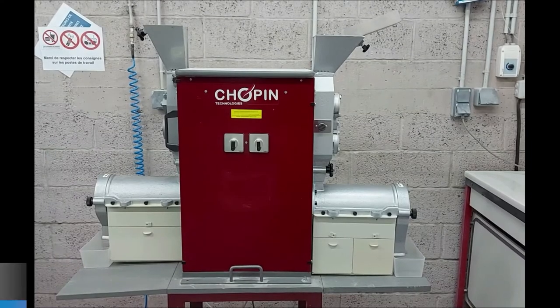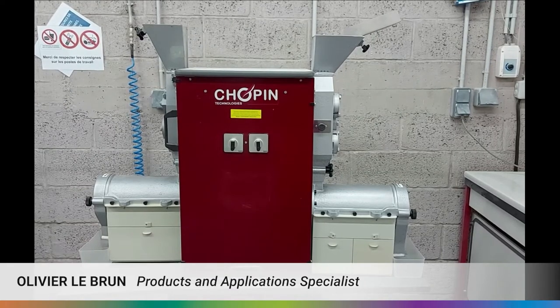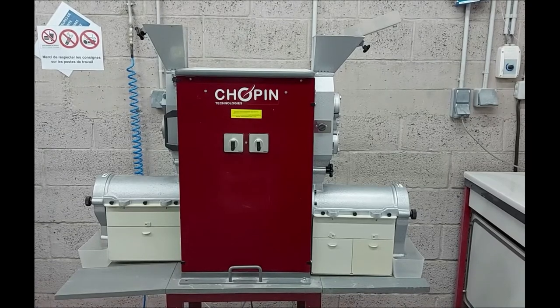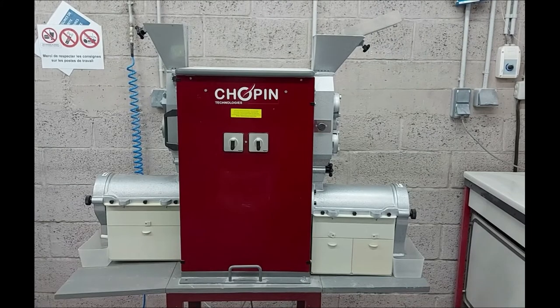My name is Olivier Lebrun. I'm product and application specialist for Chopin Technology. Today we will be going over the CD1 mill instrument from Chopin brand to produce wheat refinery flours.